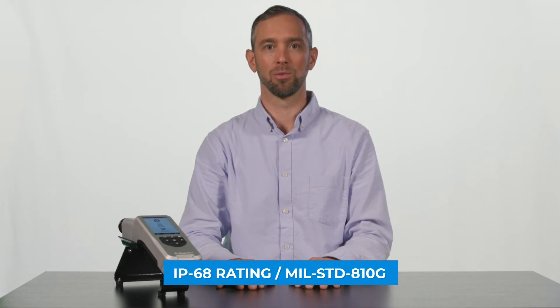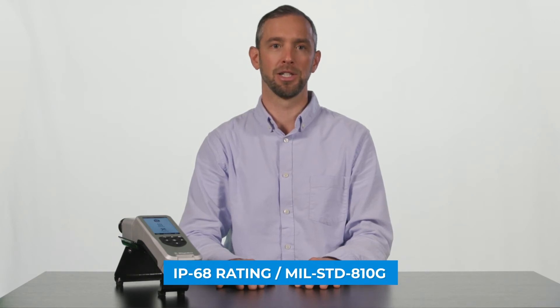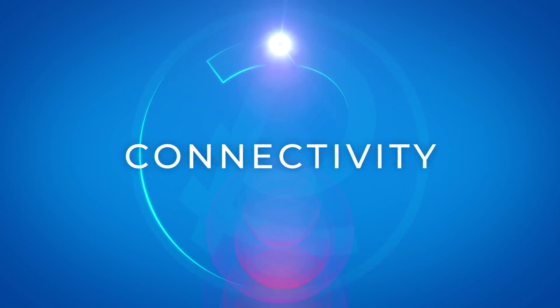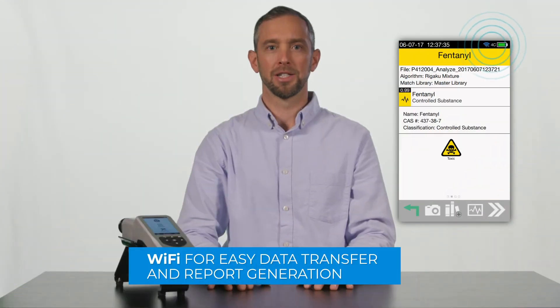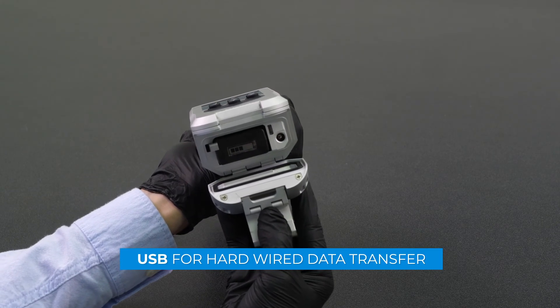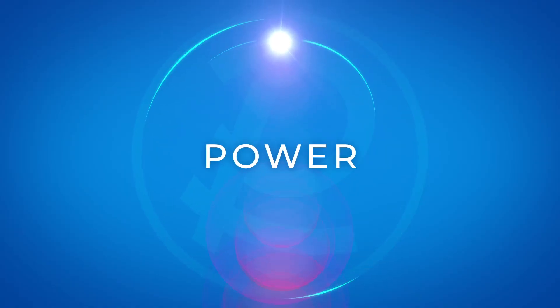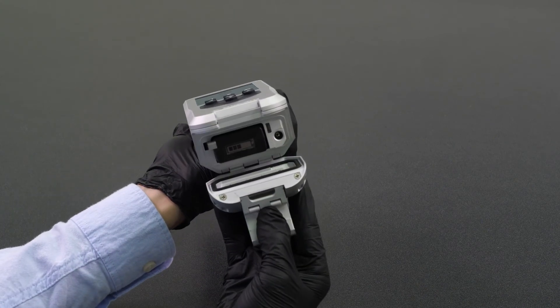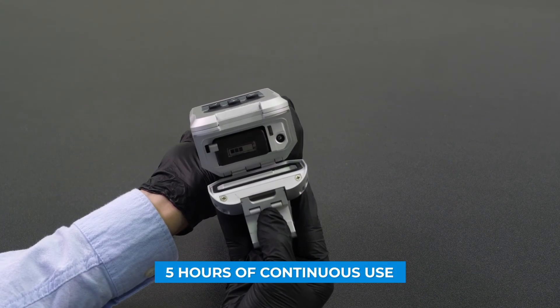The Rescue Flex is sealed with the ability to be dunked in decontamination solution. The Rescue Flex has built-in Wi-Fi for easy transfer of data and reports, as well as a USB connection for hard-wired data transfer. The removable rechargeable battery sits behind this sealed waterproof door at the bottom of the instrument and offers five hours of continuous use.